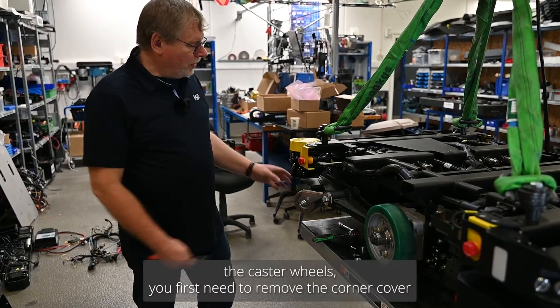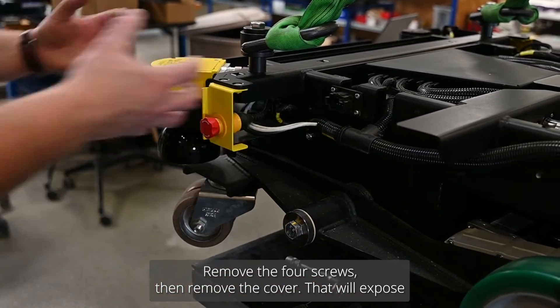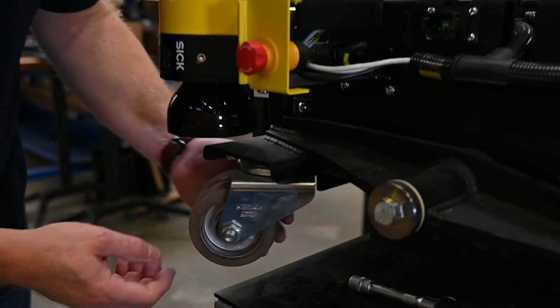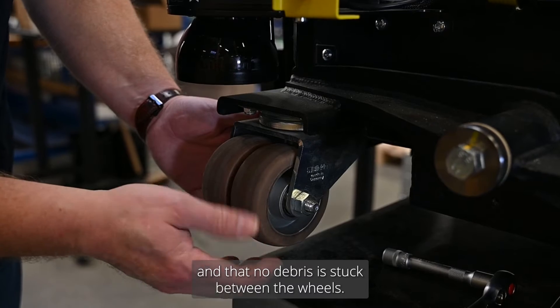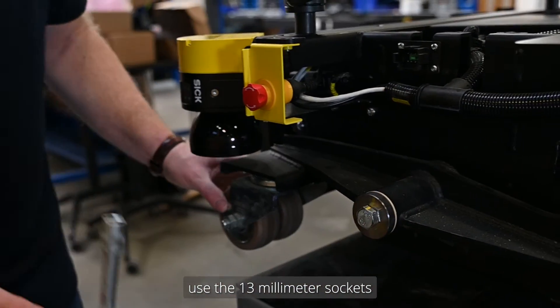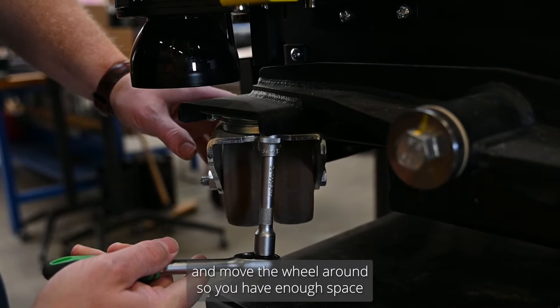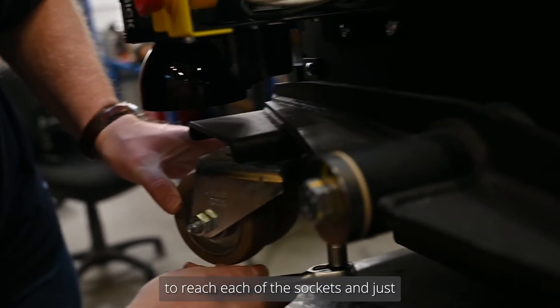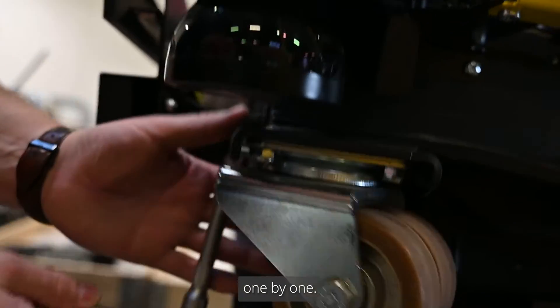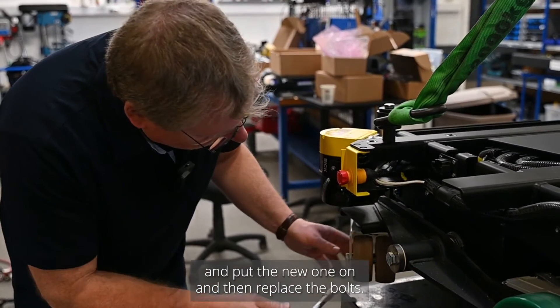To inspect the caster wheels, you first need to remove the corner cover using a Torx 30 screwdriver — there are four screws to remove, then remove the cover. That will expose the caster wheel. Check that it can turn freely, that the wheels do not have wear and tear, and that no debris is stuck between the wheels. If you need to replace them, use a 13 millimeter socket, move the wheel around to reach each bolt, loosen them one by one, remove the caster wheel, put the new one on, and replace the bolts.